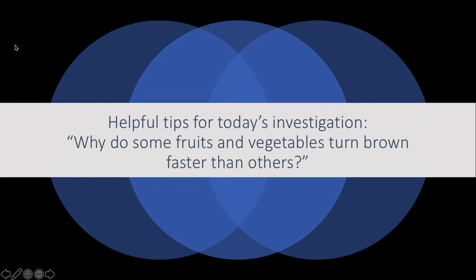All right, our investigation: why do some fruits and vegetables turn brown faster than others? Hopefully you've read the background. If you haven't yet, I would go ahead and pause right now, go read the background, and come back, because there's quite a few things that I'm going to be mentioning that assume that you have read the background.